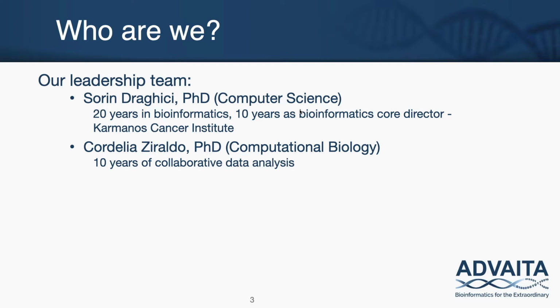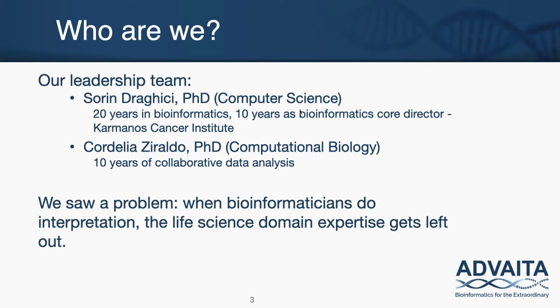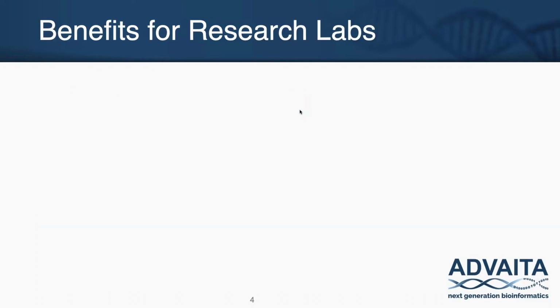But we noticed a problem, which is that when the interpretation of biological data is left up to bioinformaticians, a really important component gets left out, which is the life science domain expertise. So in order to solve that, we realized we needed to create a platform that would allow the life scientists to really dig in and interpret their own data without getting muddled in the math. So that is why we have created iPathwayGuide.